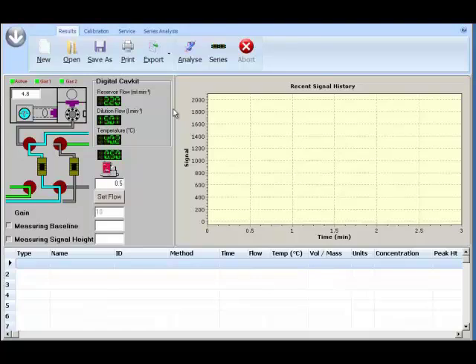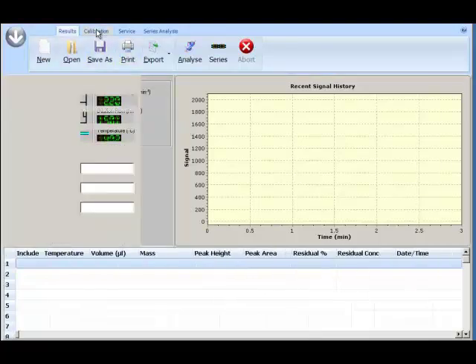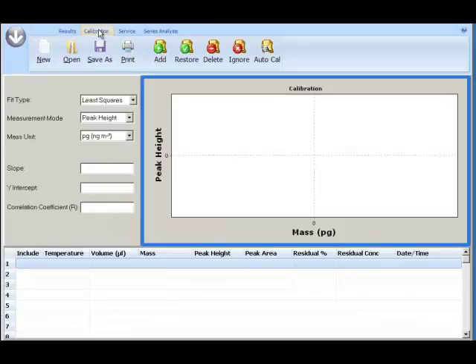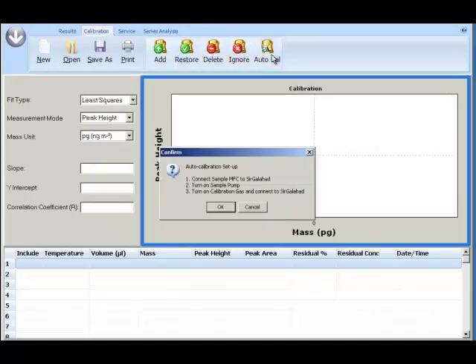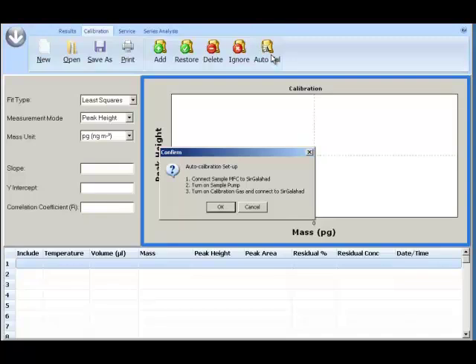When you click on the calibration tab and Auto Cal button, first you will be prompted to connect the mass flow controller and CavKit to Sir Galahad. Connect sample mass flow controller to Sir Galahad. Turn on sample pump. Turn on calibration gas and connect to Sir Galahad. Once connected, press OK.